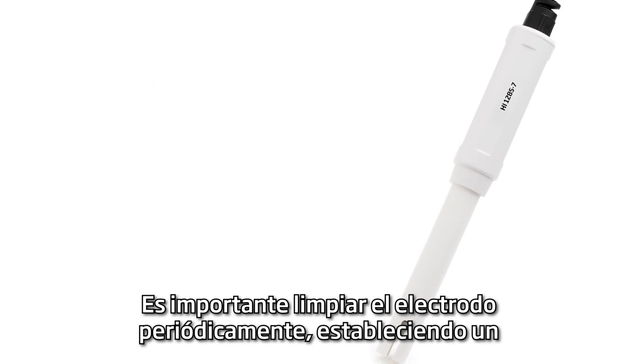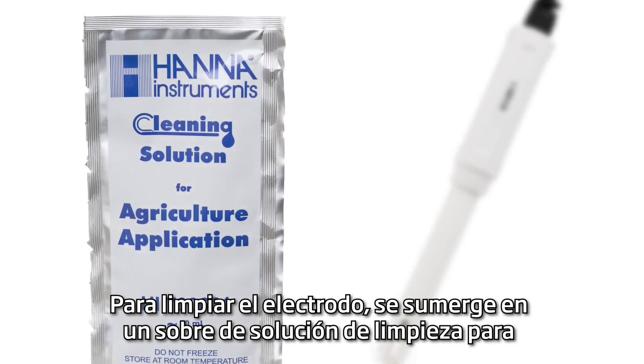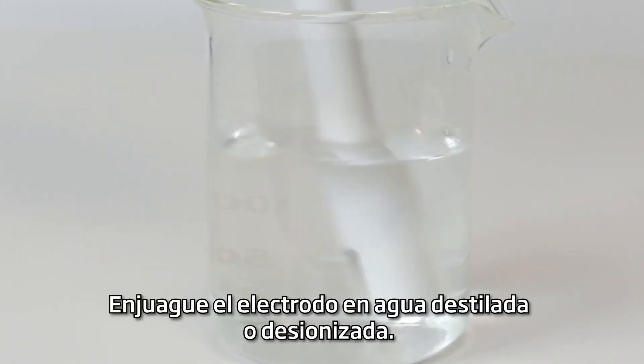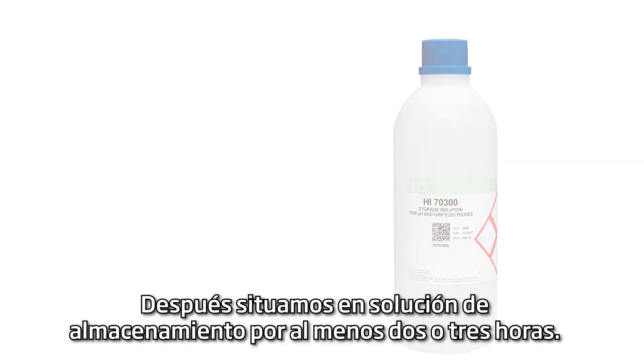It is important to periodically clean your probe and set a regular schedule for probe maintenance. To clean the probe, place it in the agricultural cleaning solution for 15 minutes. Rinse the probe with distilled or deionized water. Next, place in storage solution for at least two to three hours.